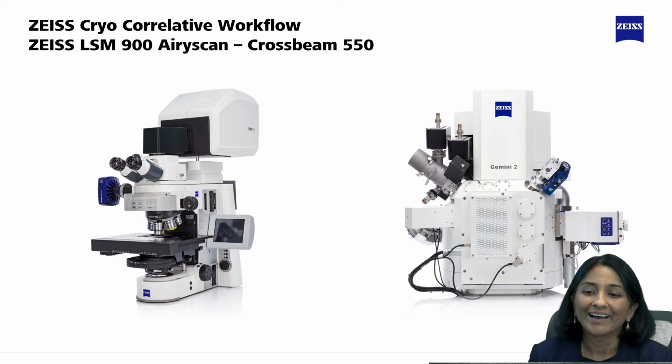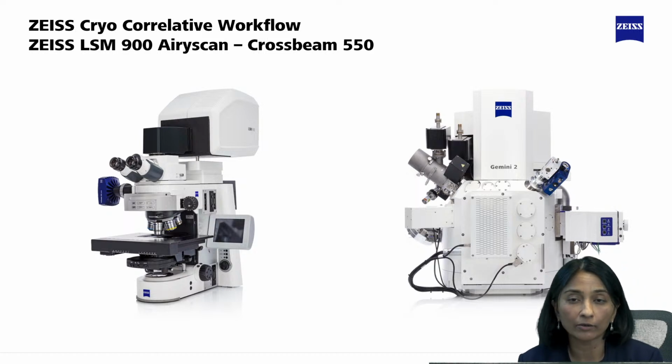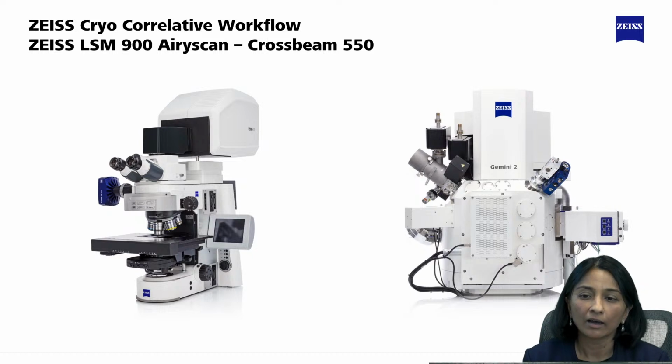So I have been doing some cryo imaging for the past couple of years, and hopefully in today's session, I'll be able to share some of my learnings from imaging a multitude of samples from mammalian cells, yeast, and so forth. So let's dig right in.